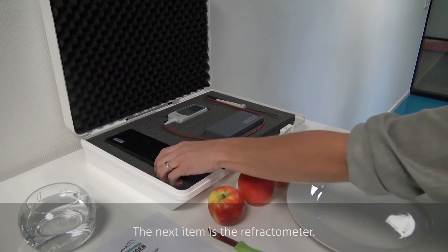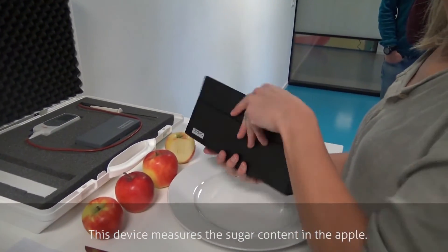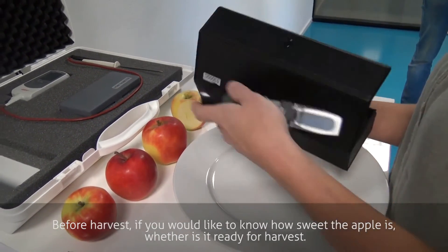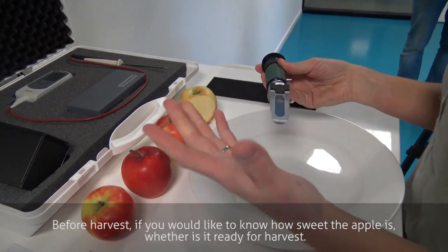The next item is the refractometer. This device measures the sugar content in the apple. Before harvest you would like to know how sweet the apple is — if it's already ready for harvest.